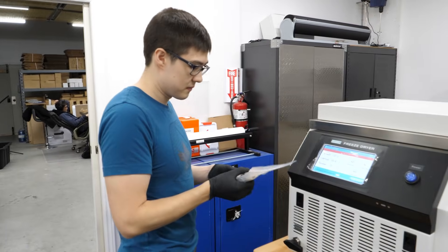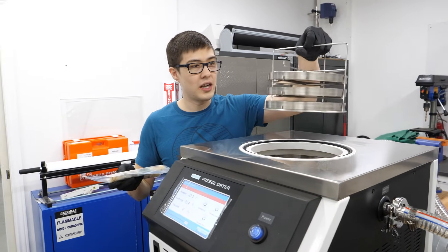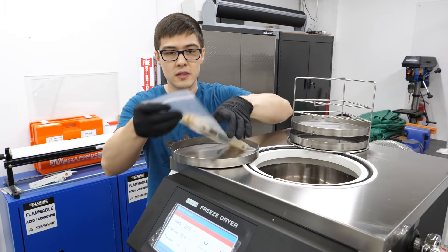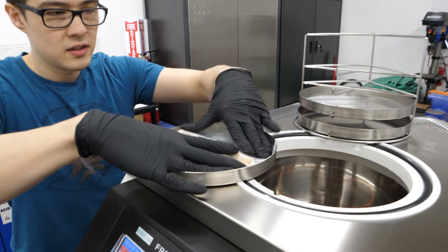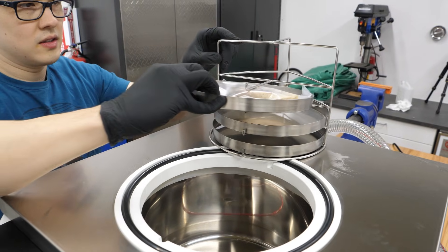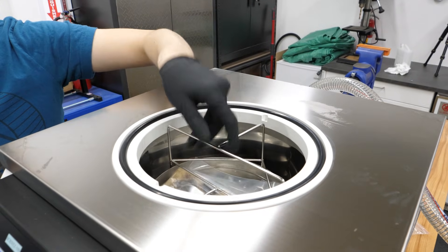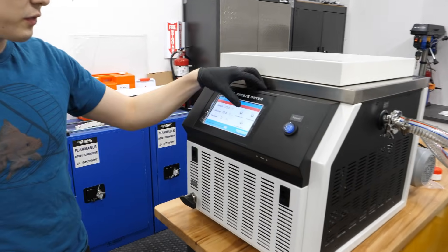It says you just have to put it on one of the trays. All right. There. You know, and then you load your sample.